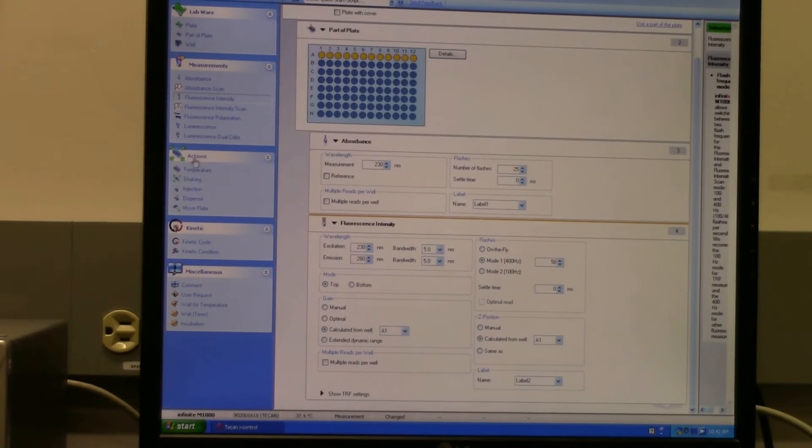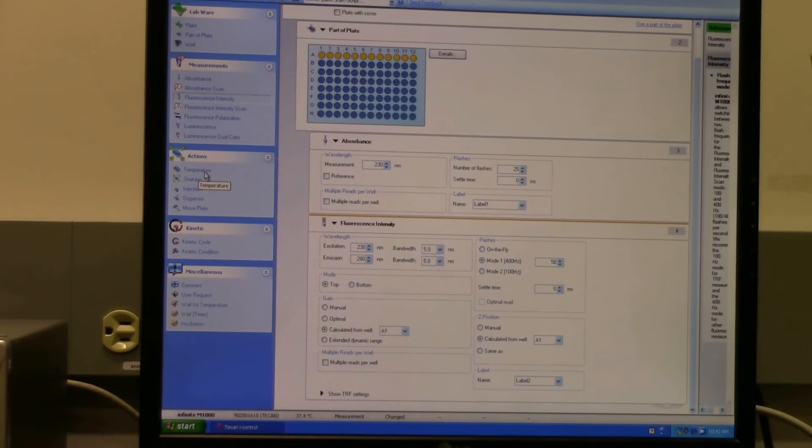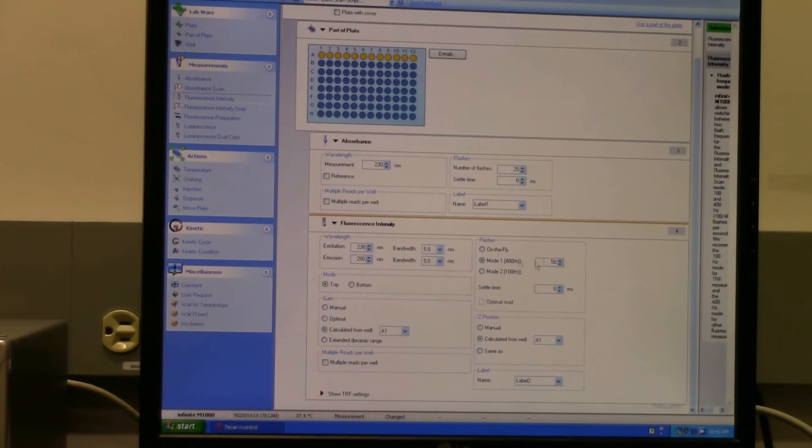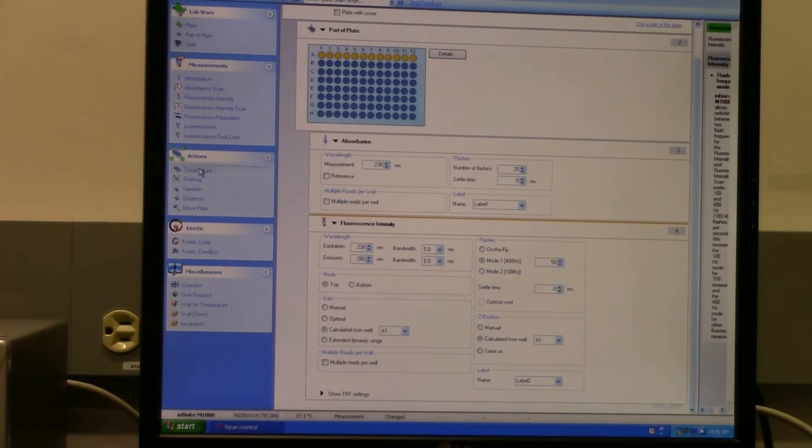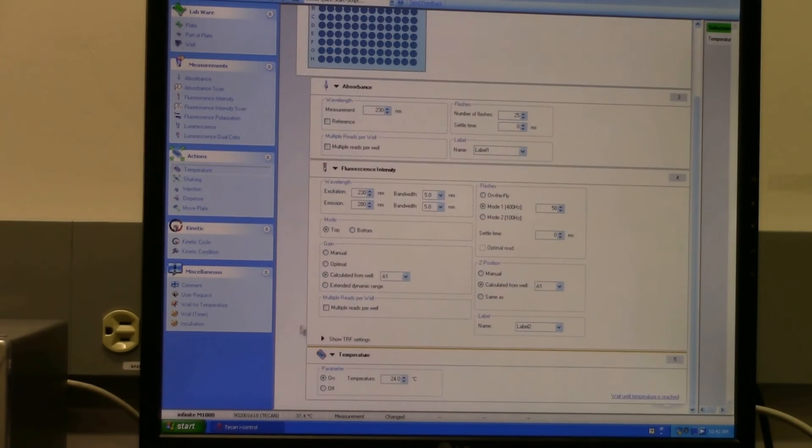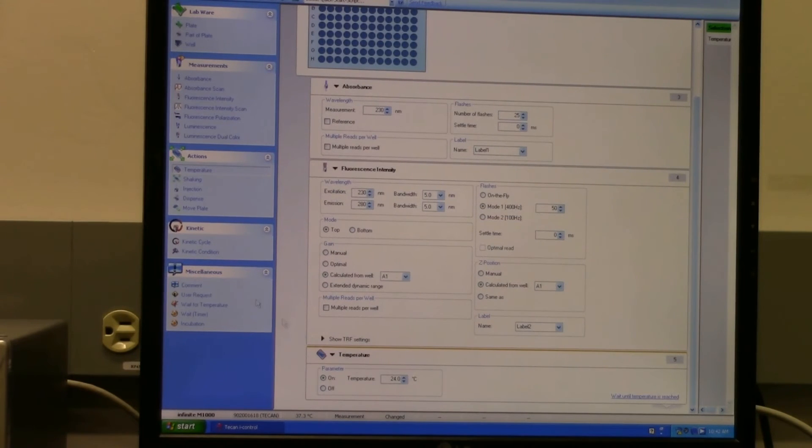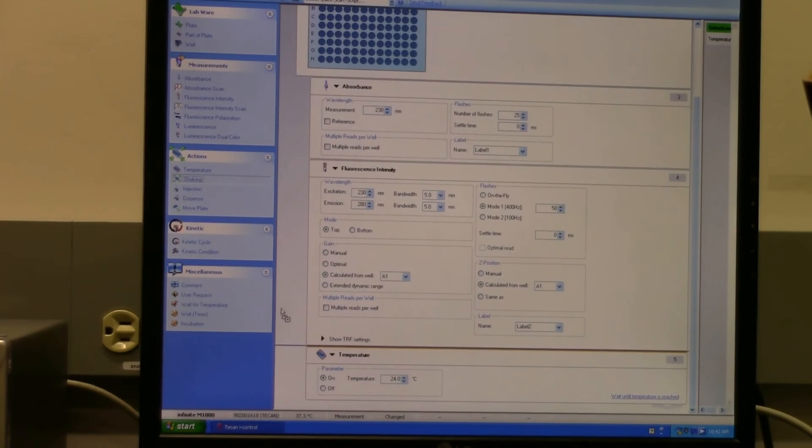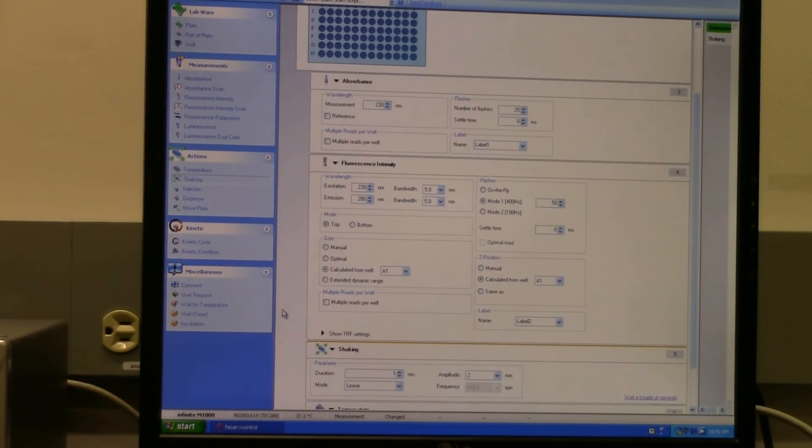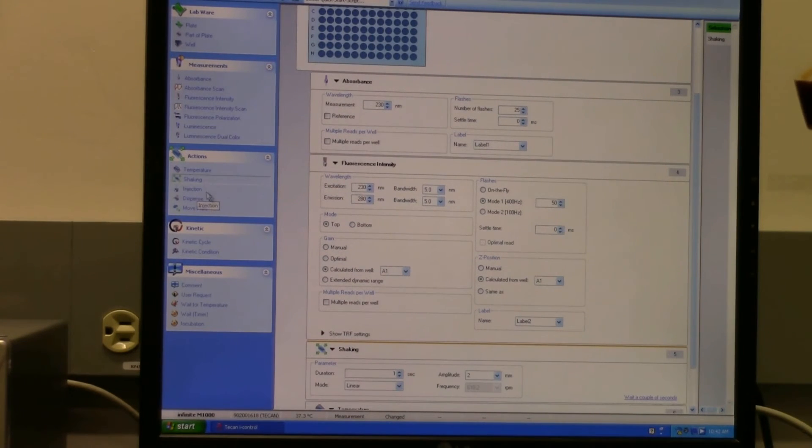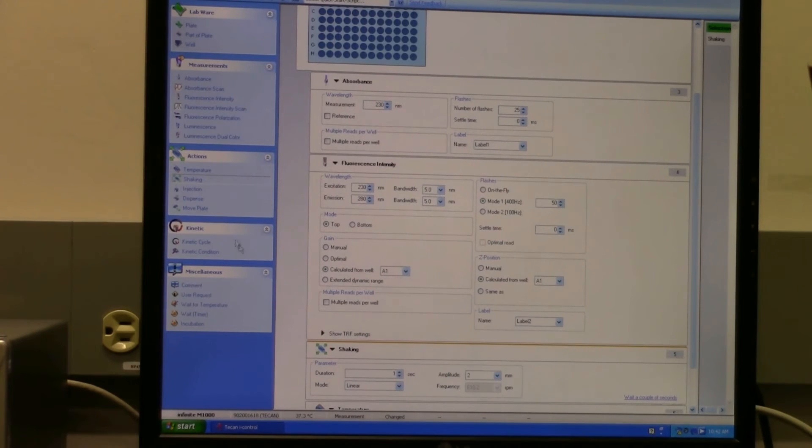And then there are some other actions that you can do. If you need a certain temperature set, you can set the temperature there. And it's all the same - you just click and drag down into here and it all just loads up in here. So temperature, shaking is another one that you can do. There's an injector that can also be used, and then there are also kinetic cycles.